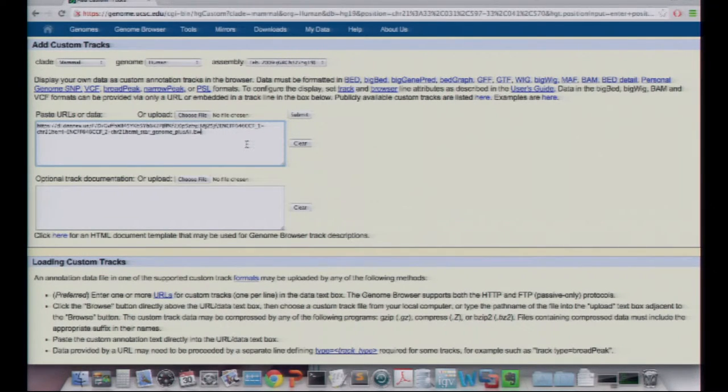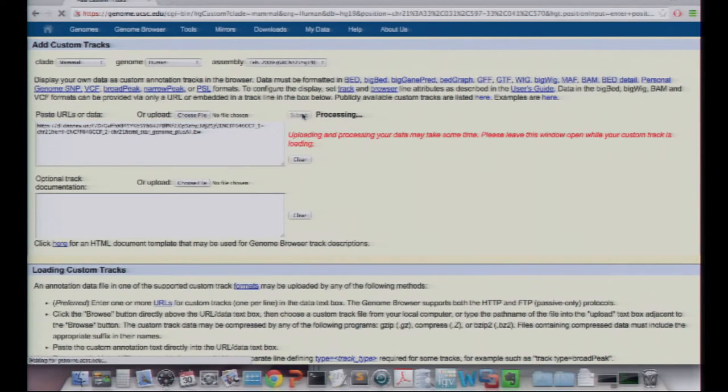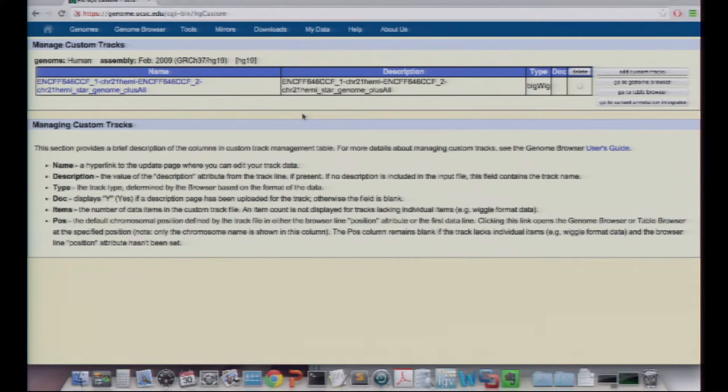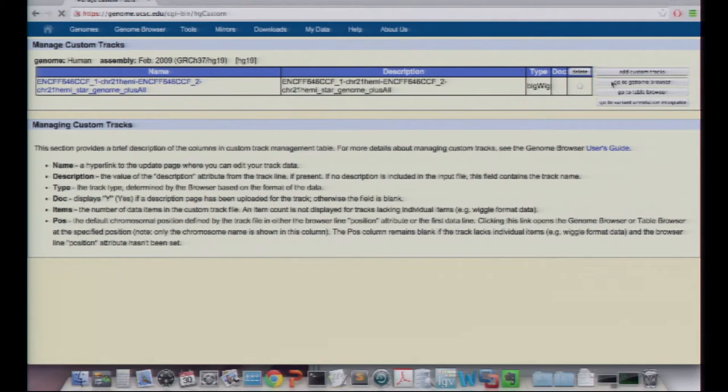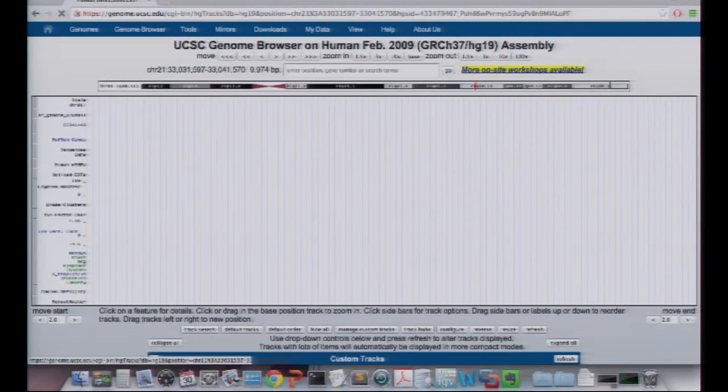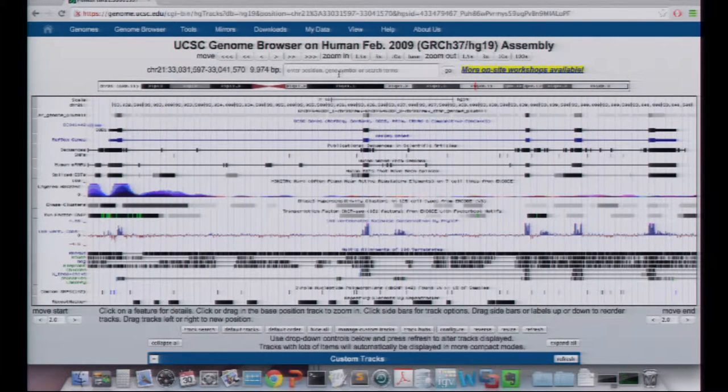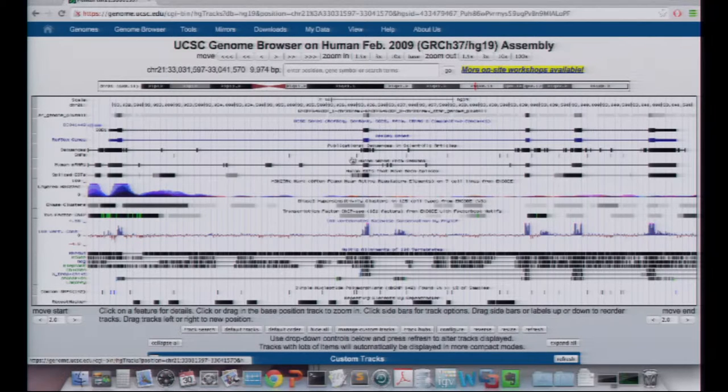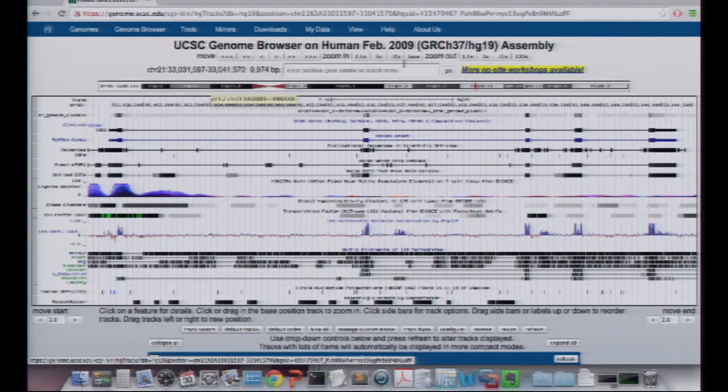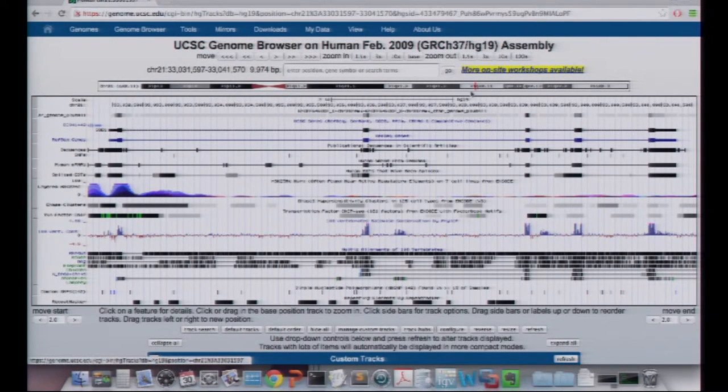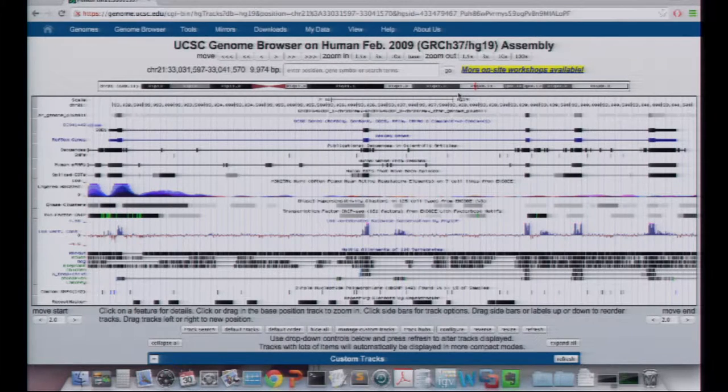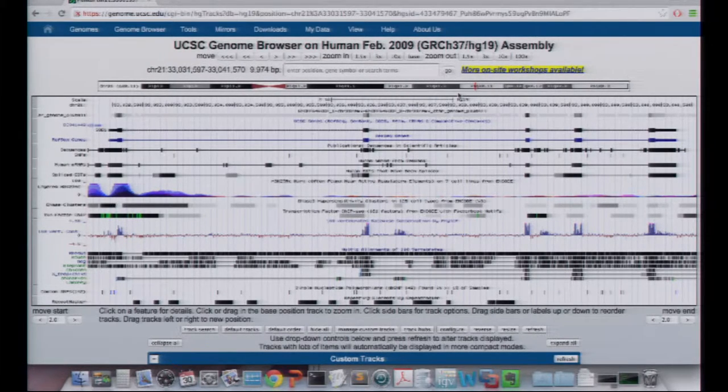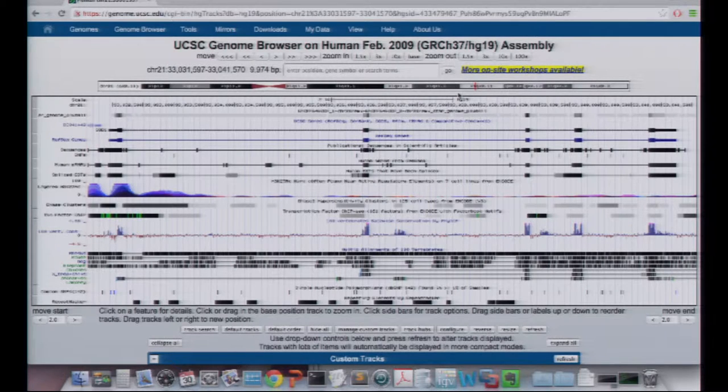If we wanted to, we could go back and do this, repeat this for all the bigwig files or for various things. I'll submit that. We'll upload it again. Just wasting bandwidth. So, once you're at this case, the Santa Cruz has found your file and decided that it is indeed a bigwig file that you set it to. If we go to the genome browser, it should draw it. Because I reset, it should set me right to SOD again, which is the default gene. But it should work for any gene located in about this central region of chromosome 21, which is about half that I picked. So, I think it's 48 million, from 12 million to 36 million in coordinates.